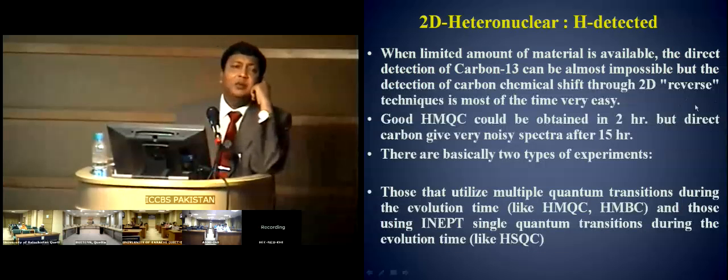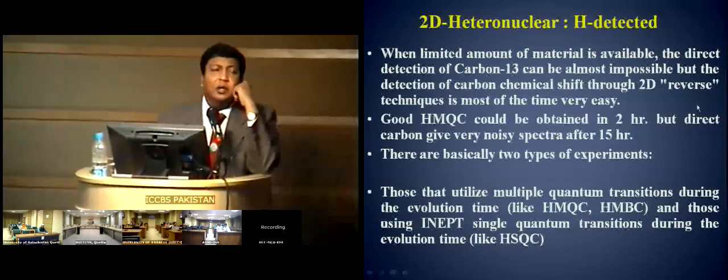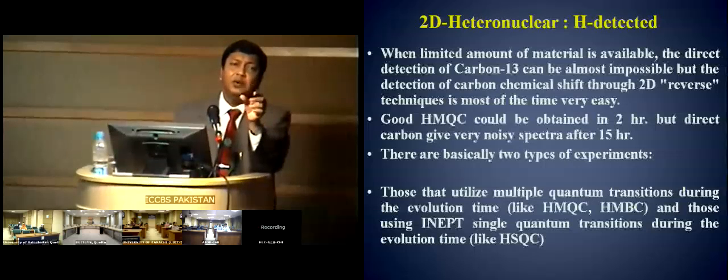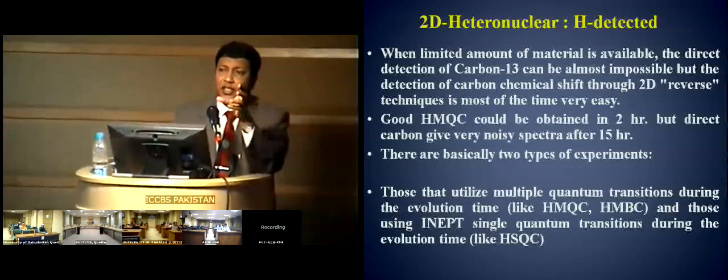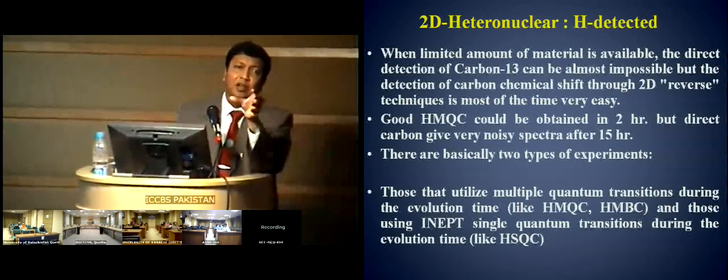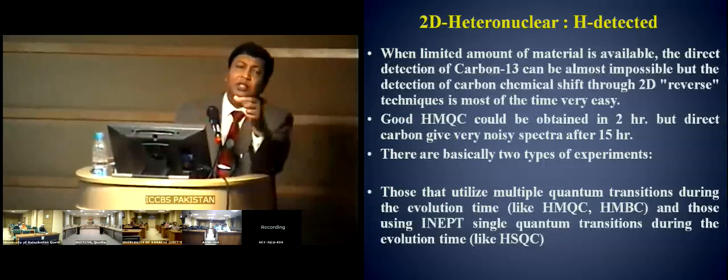But if you want to have an inverse polarization transfer, you need to have an inverse probe also. What that primarily means is that in a normal polarization transfer, you need to have carbon coils which detect the signal of a carbon close to the sample, and proton coil in the probe away from the sample. So the closest circuit is the carbon-13.